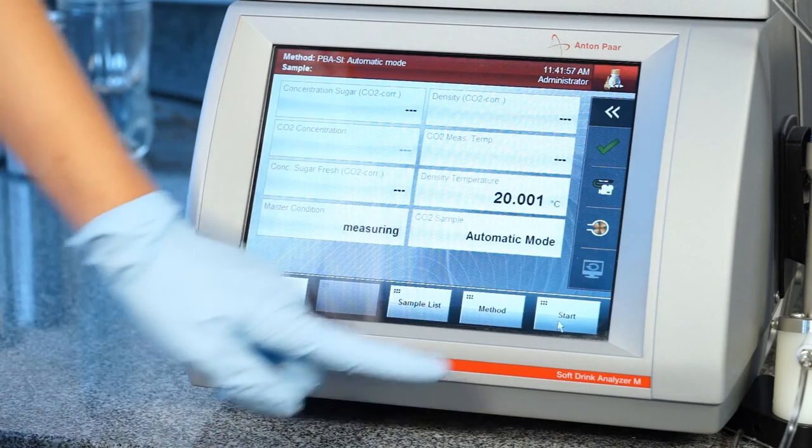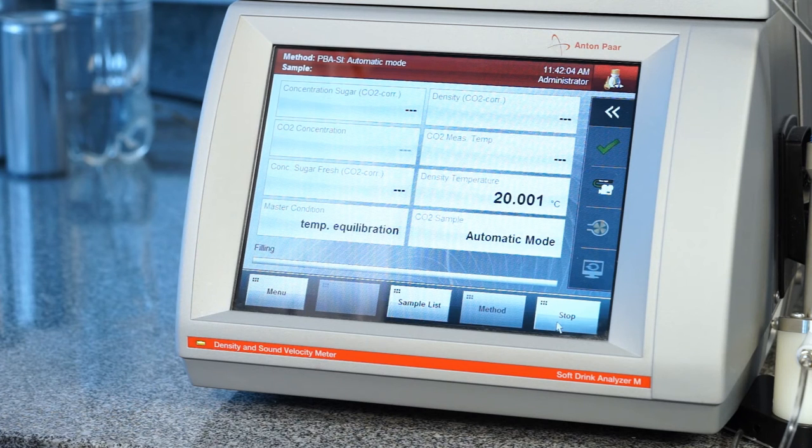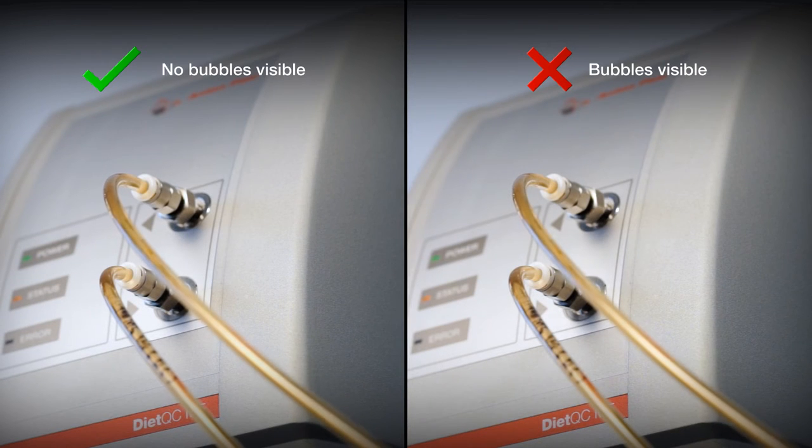The sample is transferred automatically from the container to all measuring cells. While filling, gas bubbles should not be continuously visible in the hoses. In case there are, please see the instruction manual for further steps.